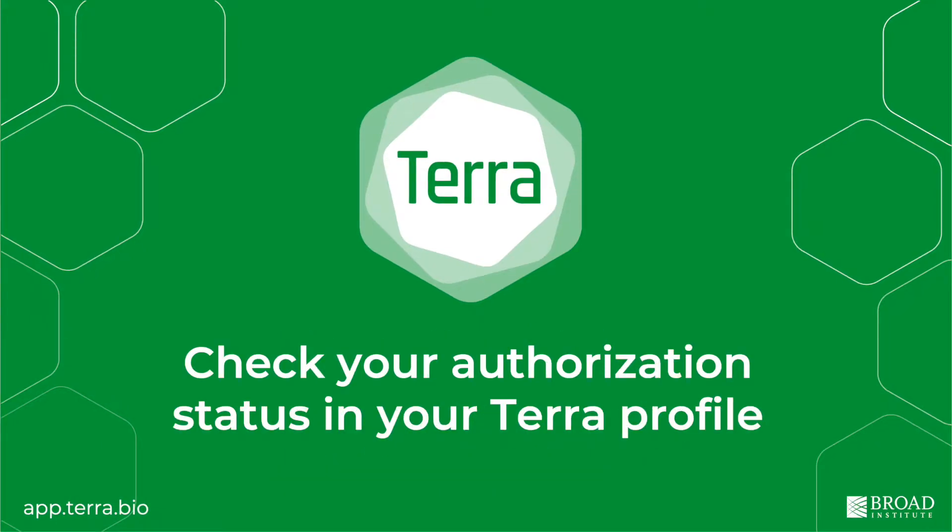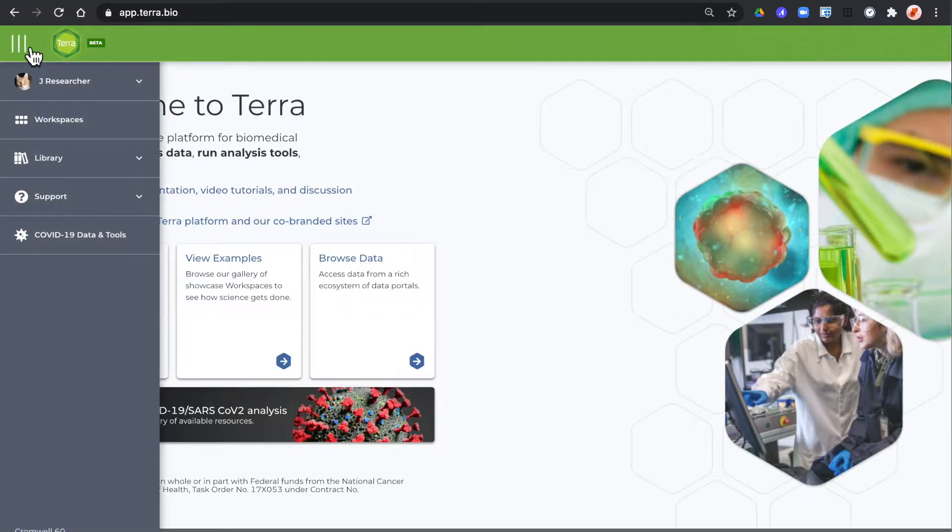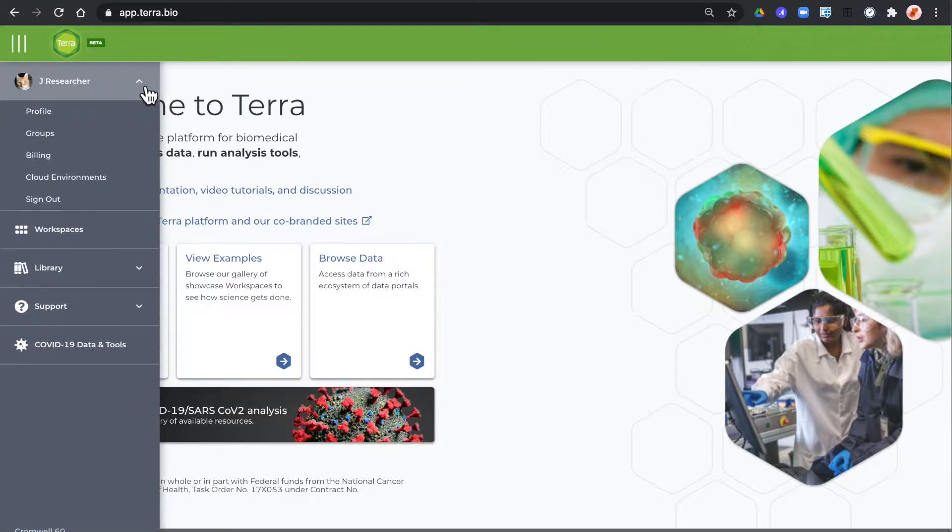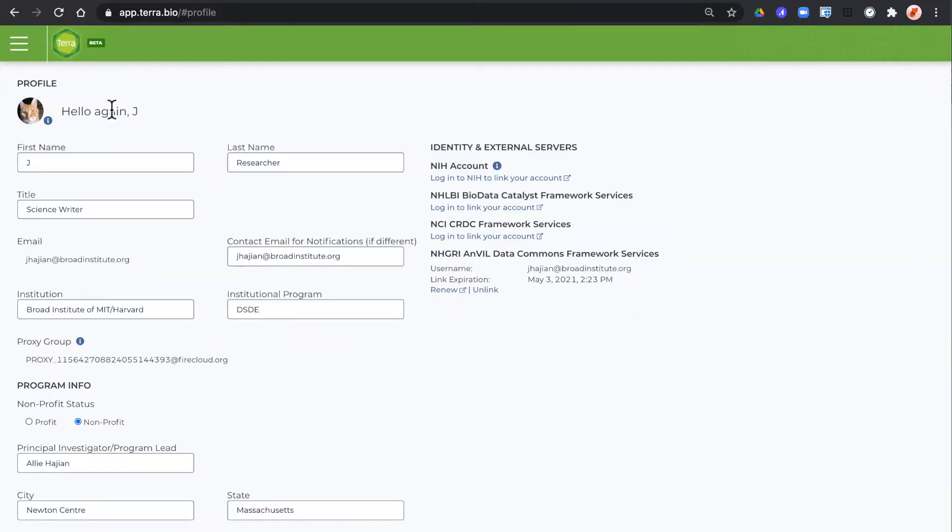Before starting your analysis it's always a good idea to check the status of your data authorization on Terra. You can do that from the top left main menu in the drop-down, your profile page. All your linked data authorizations are here on the right column, the identity and external servers.